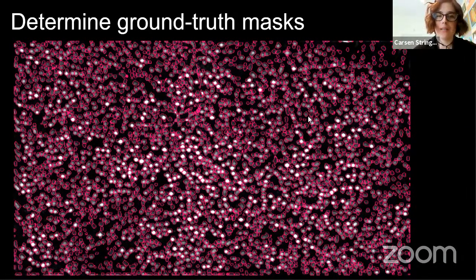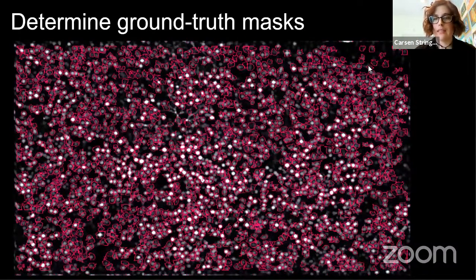And so we have the segmentation here. And then, like I was saying before, there might be nuclei labeled here that don't have expression. So I'm going to filter out the ROIs that didn't have any GCaMP highly skewed traces, and kind of recreate these masks, basically using the nuclei as seeds and saying which ones look like they have activity, which ones don't.